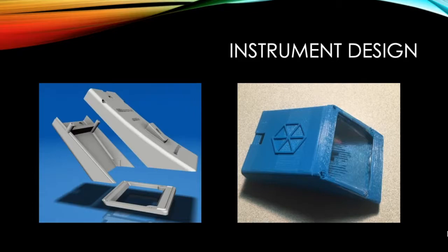This experiment employed a MakerBot Replicator desktop 3D printer, using a design for the spectrometer from Public Laboratory. The spectrometer is designed to be adhered to a mobile phone, made of 3 individual printed parts, a base and 2 body pieces. The body pieces were glued together to create a permanent bond. A diffracting apparatus was attached to the base before the base was also attached to the body.